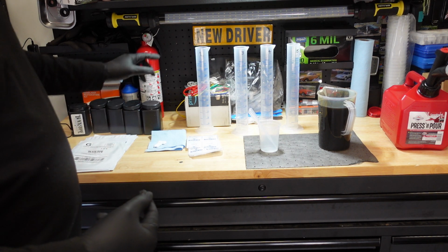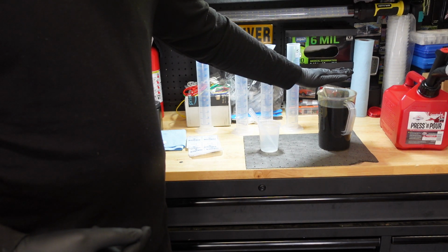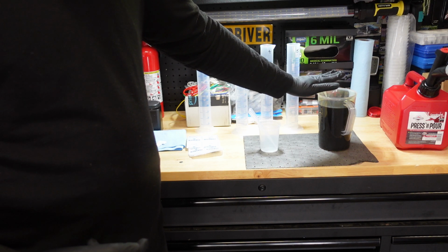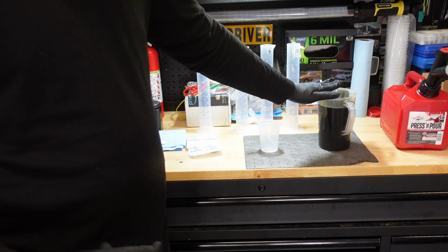So we have everything marked. One last thing I want to say is that I'm going to take the plain base oil and submit a sample with no known added gasoline to it. That's what you're going to call the baseline.